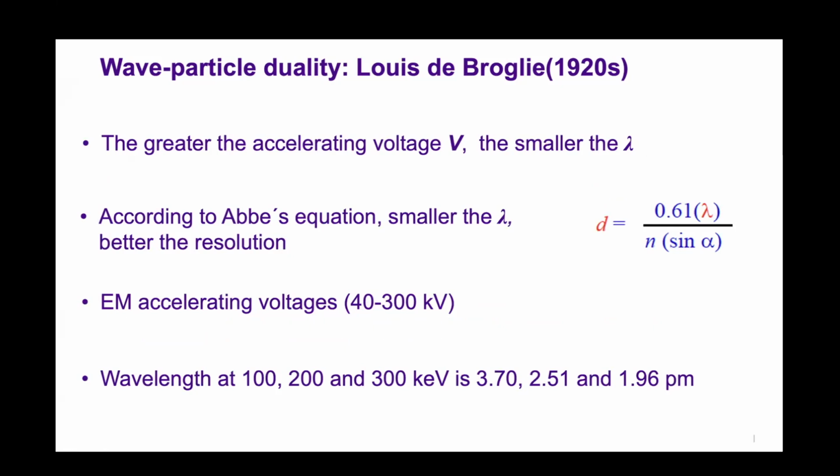That means you now go to the resolution into atomic scales, nanometer, atoms. You start to go from a naked eye to 400 million times more resolution than a naked eye can see, and 4,000 times more than a simple optical microscope can see. So this is the whole idea. There's a basic concept. There comes the quantum physics and mechanics, wave particle theory, and then use the same thing, and then you start to see.